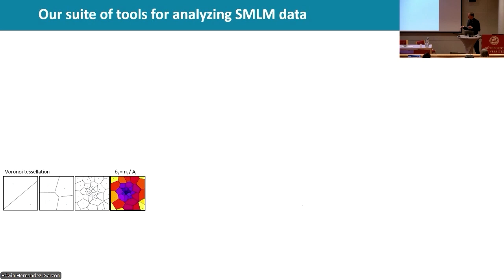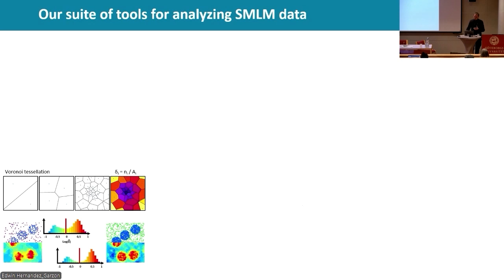And so what we did is that we used that in order to generalize the computation of local density in the Voronoi diagram. And we show that we were able to do a very simple kind of normalization. It's not a mathematical normalization, but it's working very well: if you have something of similar spatial distribution, the same cluster, but just with different density, you are able to normalize this density just by dividing with the average density in your data.